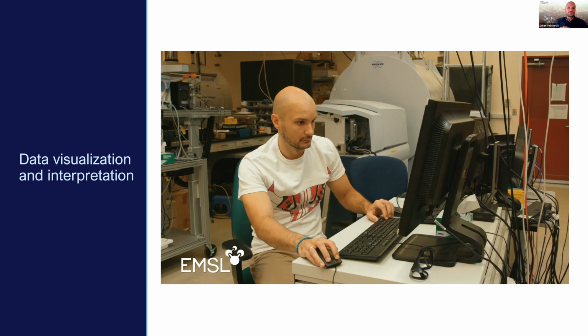For processing those data and visualizing our images, we also use sophisticated software that enables us to see the relative distribution of molecules, the relative quantification, and differences in abundance between different cell types or between different tissues that we analyze. So this short video will show you what kind of data we can generate.